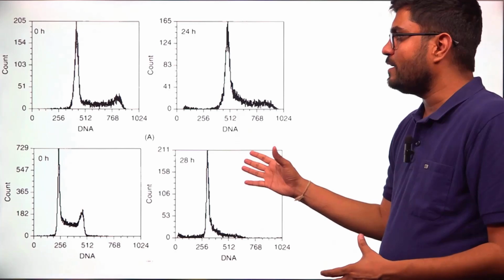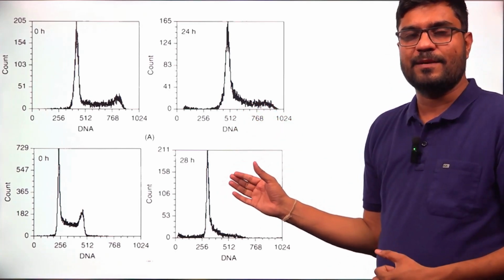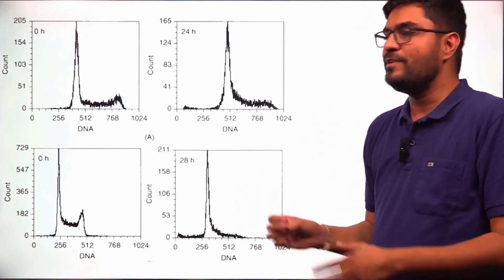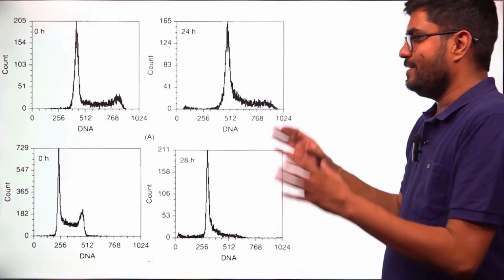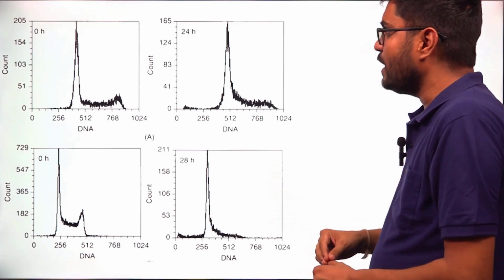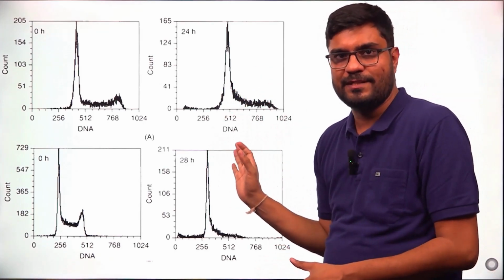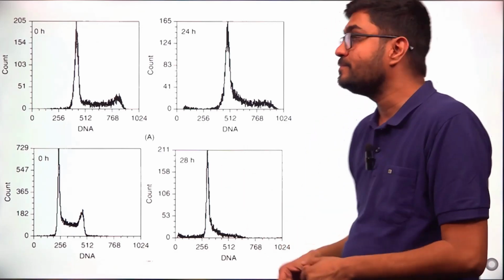We have understood how the graphs will look if the cell cycle inhibitors are blocking the phase G1 or the S or the G2. So we have understood the concept, graph, some part of mathematical modeling, and applications also. Before ending this video, I will be explaining the brief protocol, how we perform this assay, how we do the pipetting, and what steps are important.